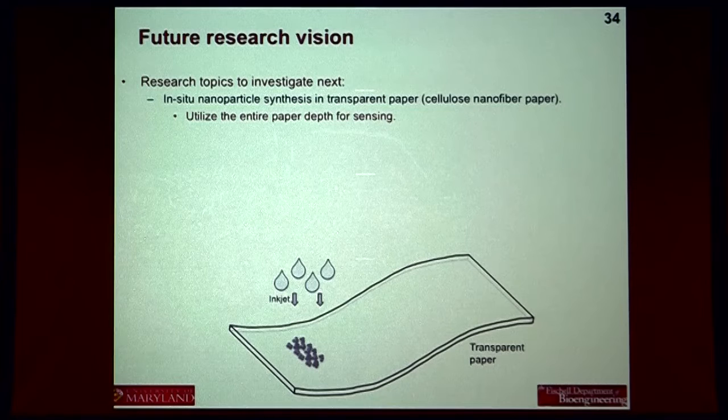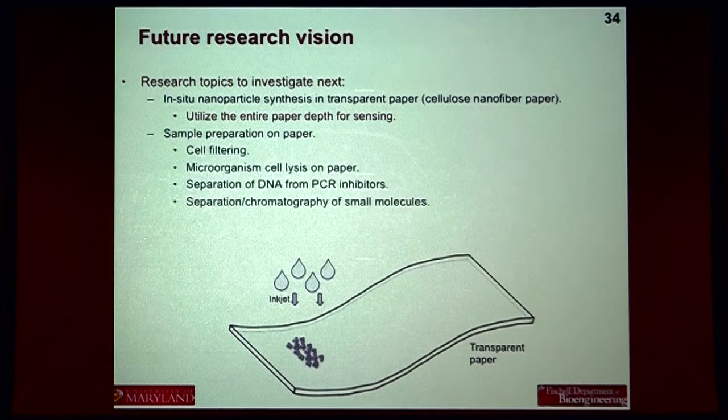So what we envision is actually doing an in-situ synthesis of nanoparticles throughout the depth of a transparent paper. Everything we're doing right now, we've got a sample that is in the entire thickness of the paper and a detector that's at the top of the paper. So there's an inefficiency there. We'd like to be able to sense through the entire depth of the paper.